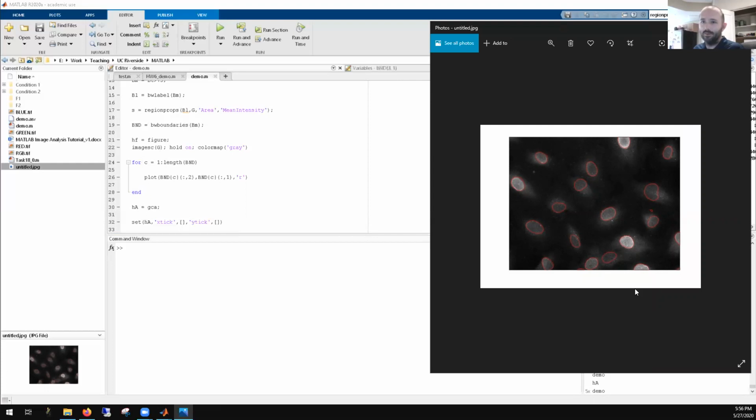The white border is super easy to solve, and then there's also another way that we can work around the well image. But let's talk offline or talk next time, so that everybody can benefit as well. The white border, we basically just adjust the figure size and we adjust the axis size, and we'll get to that eventually. But this is all very doable. These are good questions. Excellent questions. Okay. Sounds good. Thank you, Josh.